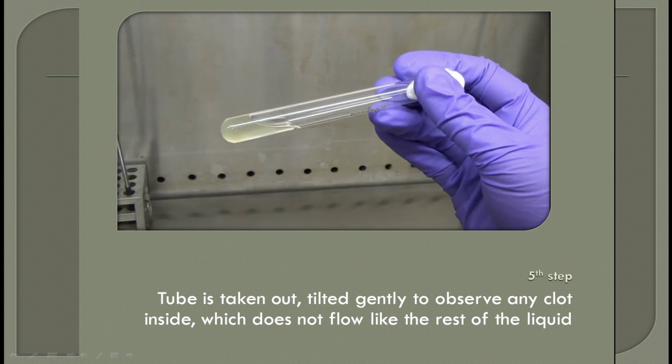Why do we tilt it? So that the unclotted liquid can flow, and the clotted one will be easily differentiated. Why do we do it gently? So that the clot, which is not that stable, not that strong, does not break off. Okay? If this clot is actually seen, voila, it is tube coagulase positive.